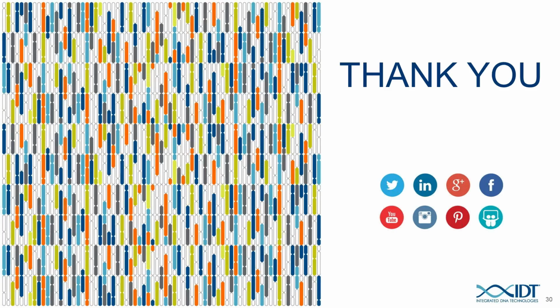Okay. The next question that I have is how long is the Cas9 active inside the cells after you do the electroporation? That's a good question, and it's going to depend a bit upon the cell type. We have done some testing and tried to track the Cas9 after delivery. It seems like for cells that have high turnover, typically Cas9 stops being detectable by Western by around between 3 to 7 days.